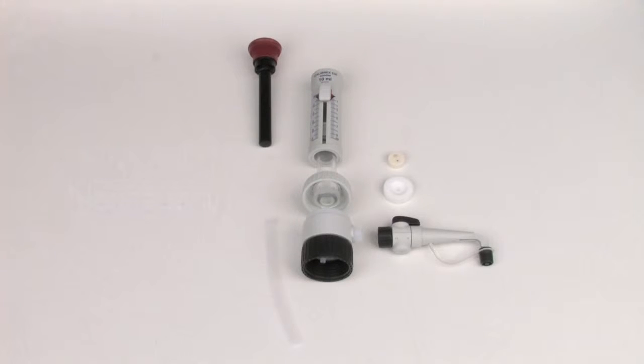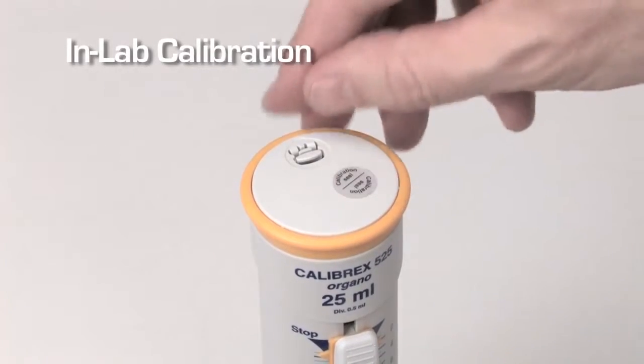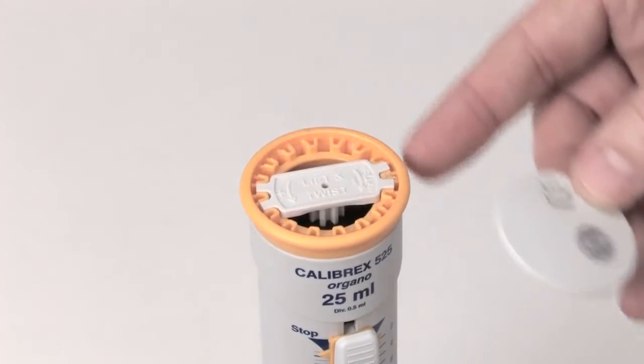Individual components are also available separately to be used as spare parts. If a new calibration is required, the calibration key is located under the cap. The operating instructions provide full details of the procedure.